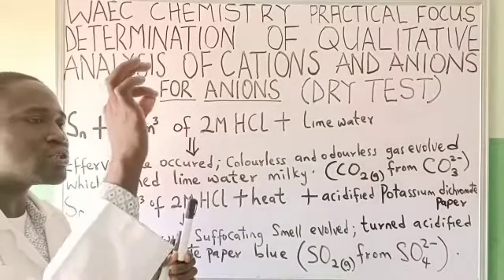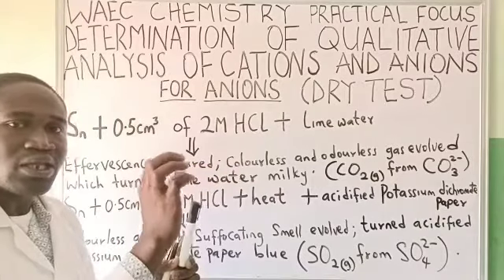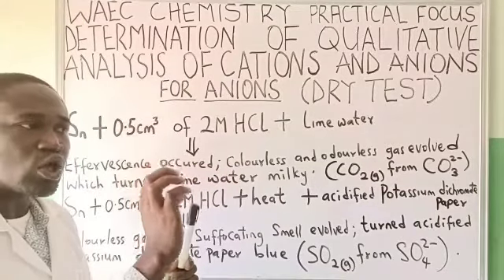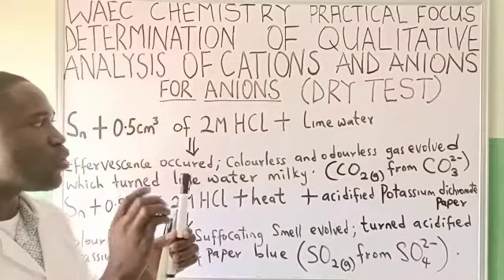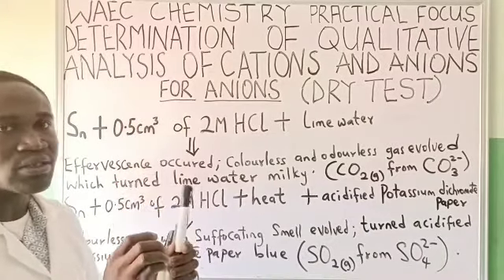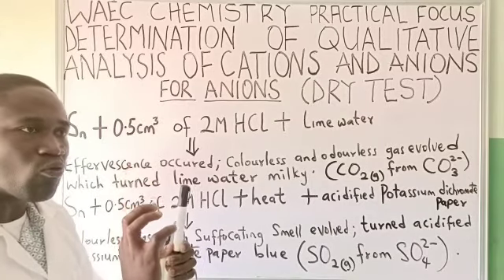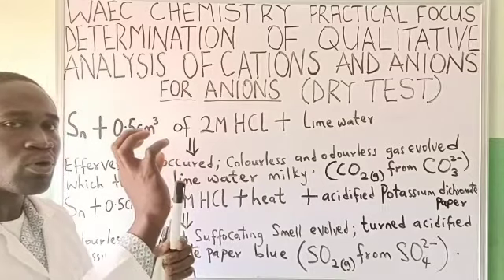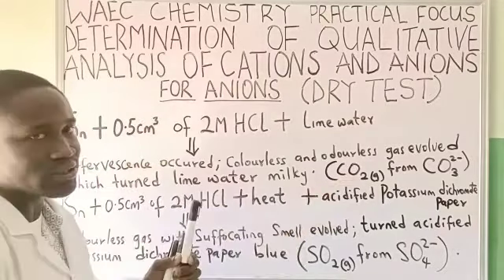The result you will get is what we call effervescence. The fumes of the Sprite that will come up is because of what? Carbonate.